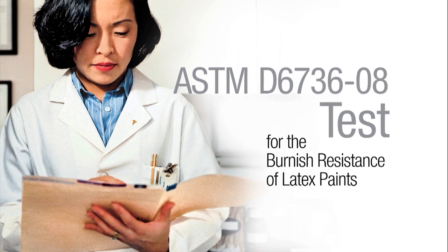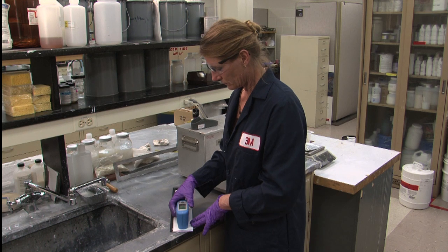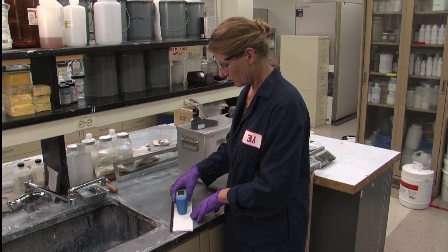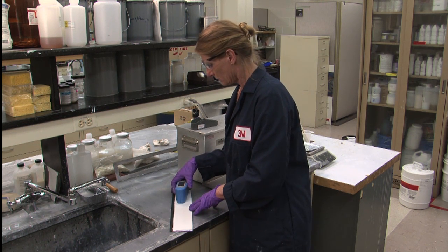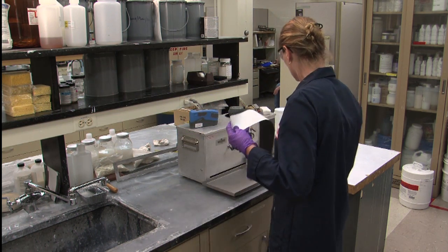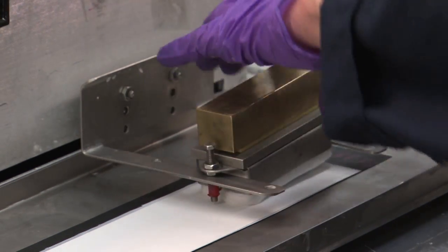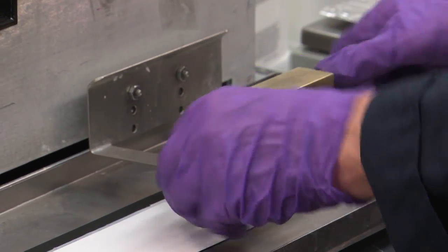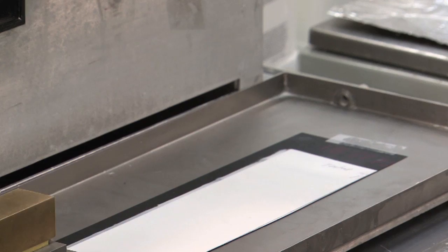This ASTM test yields quantitative estimates of a paint's burnish resistance. We've already prepared a drawdown panel. First, we measure gloss at both 60 and 85 degrees at three points along the panel using a tri-gloss emitter. We use four-ply cotton mesh on our attachment. The test consists of 20 passes, with the cloth covering on the attachment rubbing the panel to burnish it.